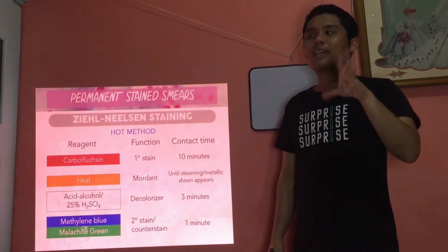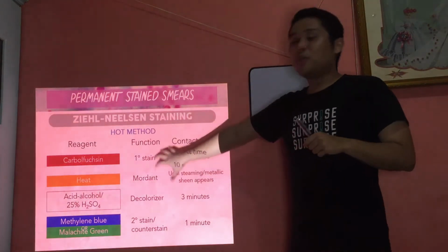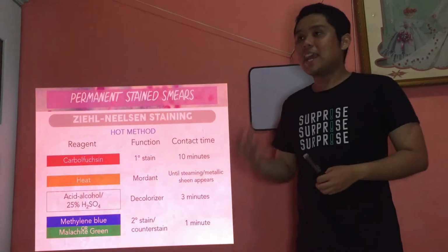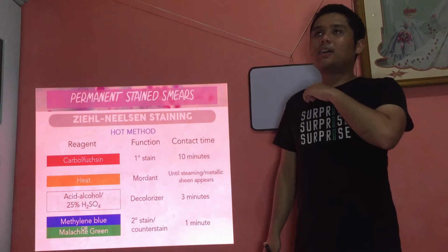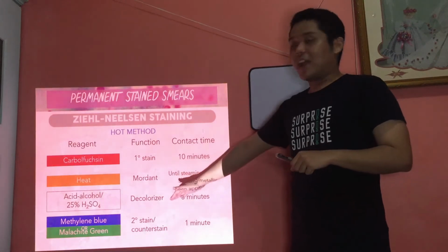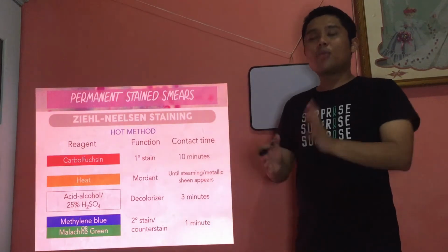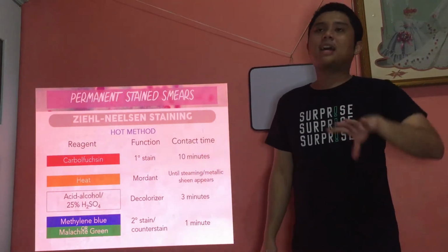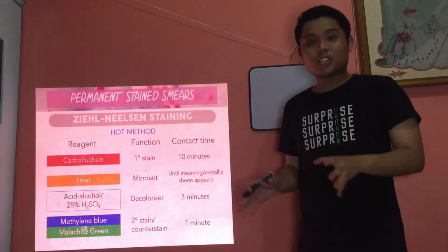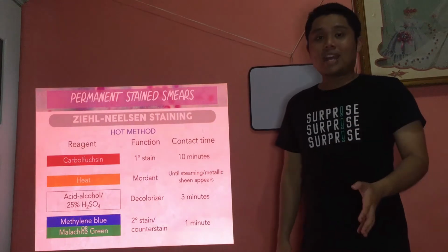Now, the decolorizer is a reagent that tests. It will test the relationship between the carbolfuchsin and the mordant. Is it really able to hold on to the primary stain, which is carbolfuchsin? We add the decolorizer because it's through decolorizing that we are able to divide the bacteria or the organism under study into different groups. That's the purpose of differential staining. It's a staining method that can divide the bacteria or parasites into 2 groups. And we accomplish that through the decolorizer.